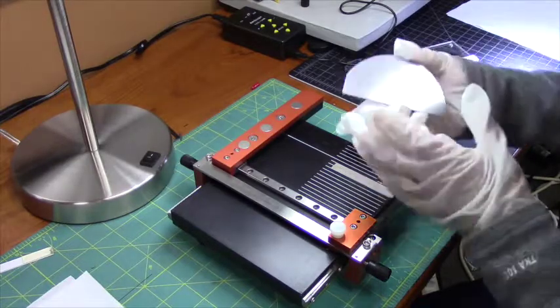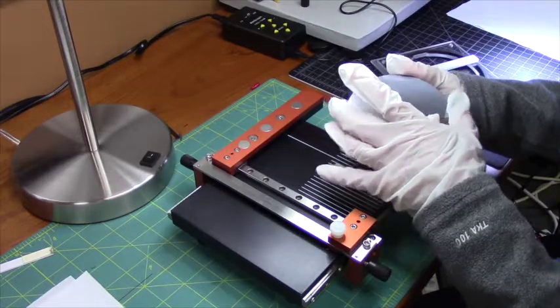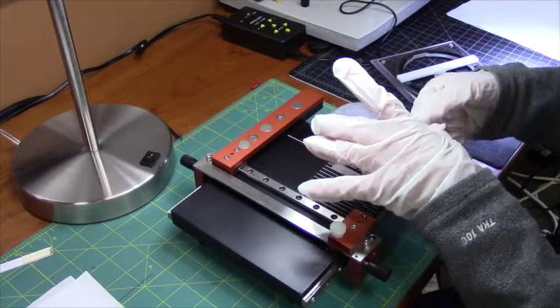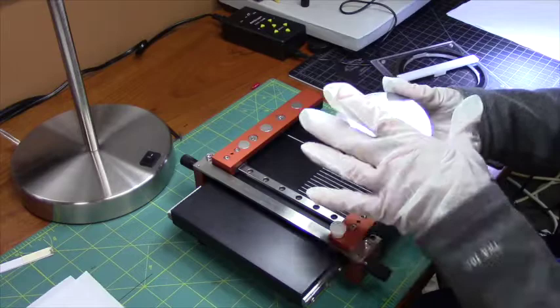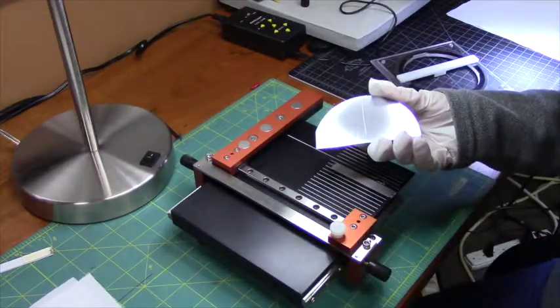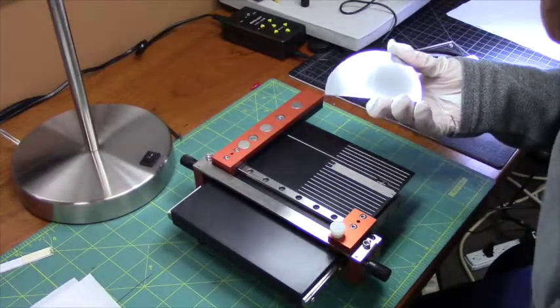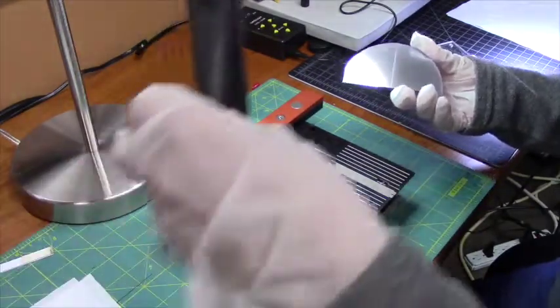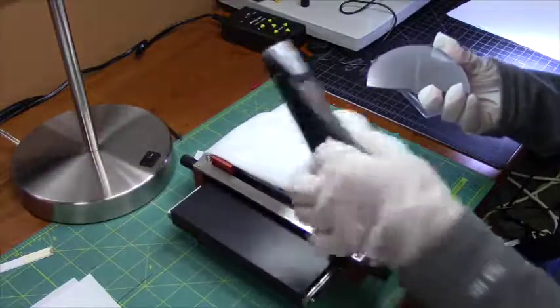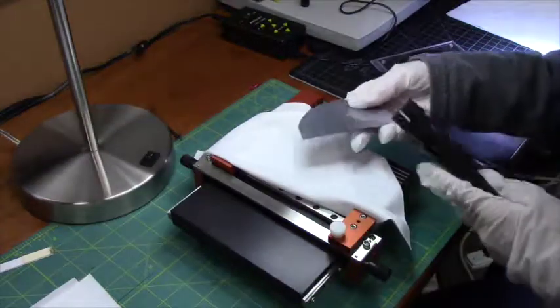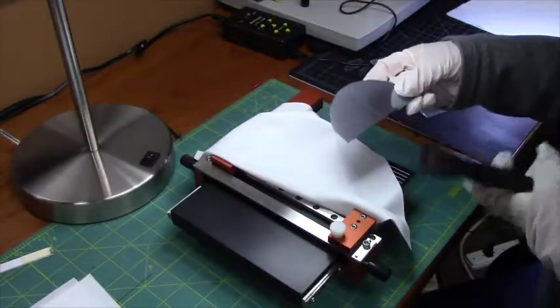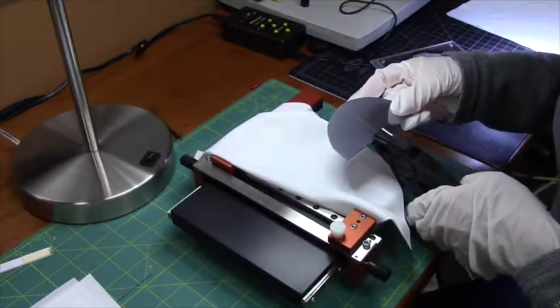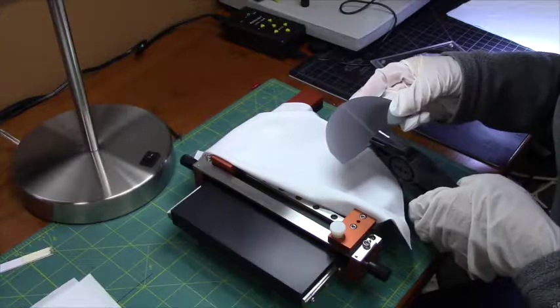Move it from the holder, flip it over, and I'm going to cleave again, or break again, using the pliers.